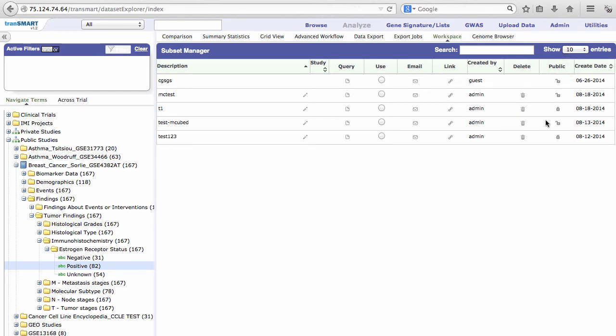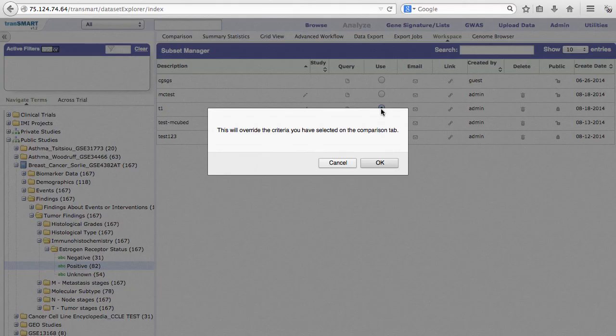If you click Use on a saved subset, you will get a notice that the action will override the current contents in the Comparison tab. Click OK to accept.